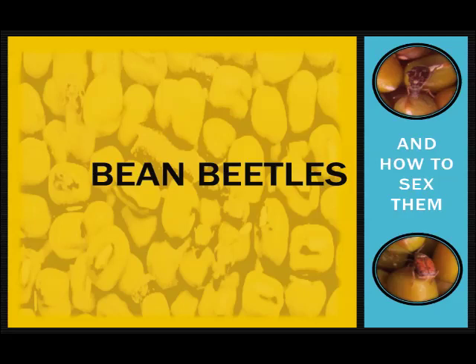Are you getting frustrated because you can't sex your bean beetles? Is it cramping your sex class's style? Well, welcome to the Bean Beetle Sexing Instructional video. In this video, we're going to go through how to identify male and female individuals of the bean beetle Callosobruchus maculatus. There will be still shots and videos for practice, so get ready!